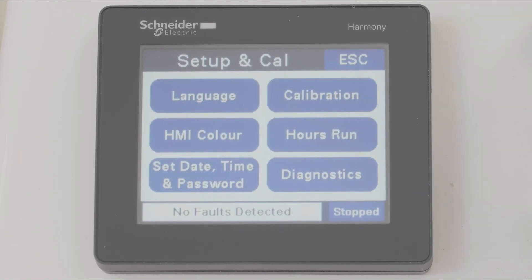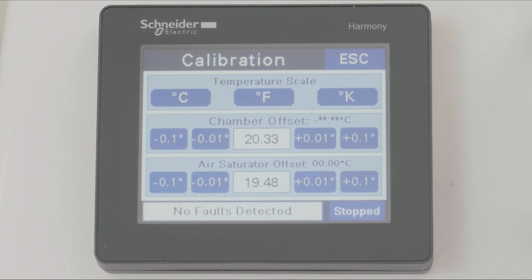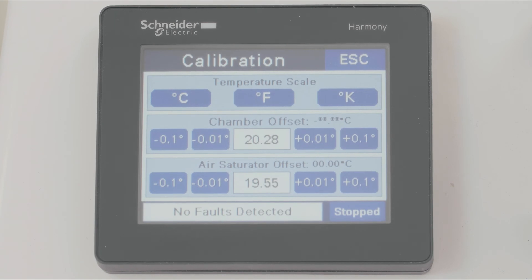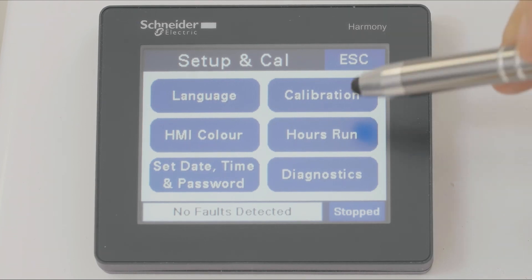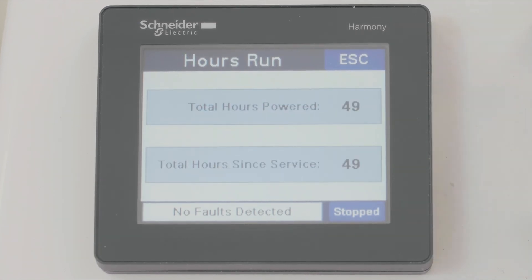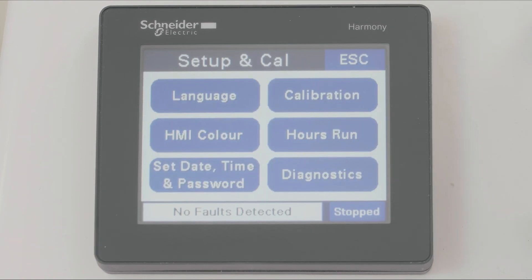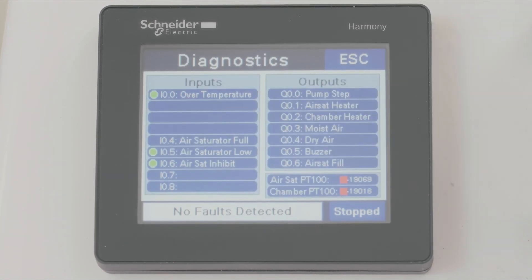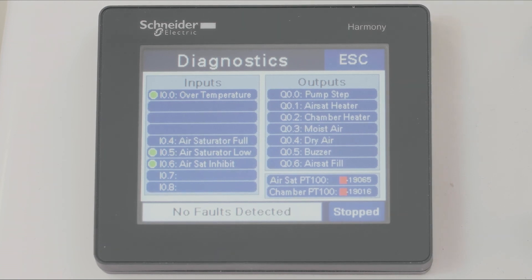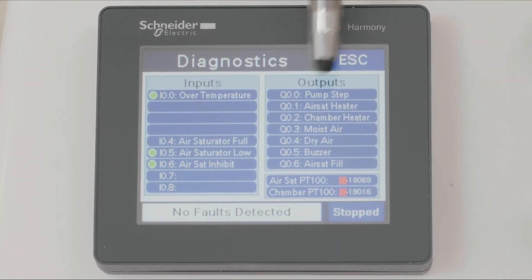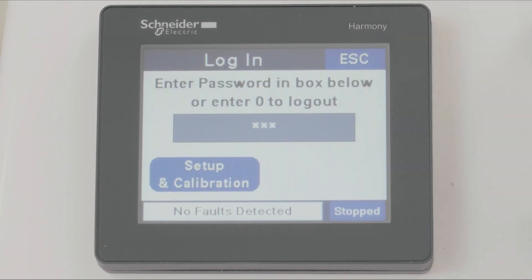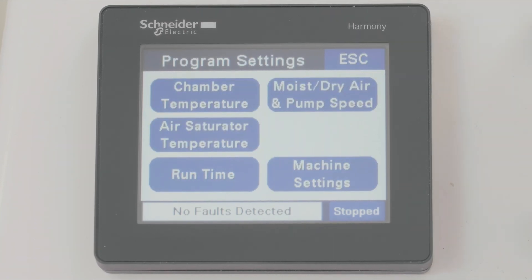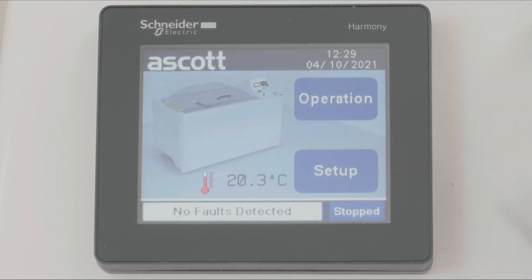We can access the calibration menu, where we can make adjustments to the temperature with reference to an independent calibrated temperature probe. We can monitor the hours run so far. And we can also go to the diagnostics page, where we can see the inputs to the chamber PLC and the outputs. If we press escape, we revert back to the previous page and back to the home screen.